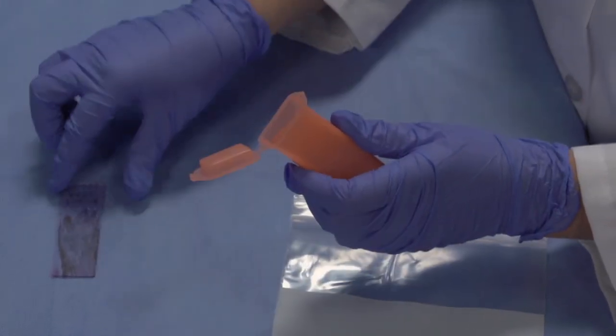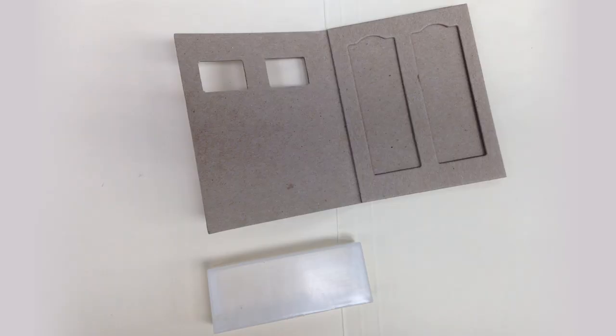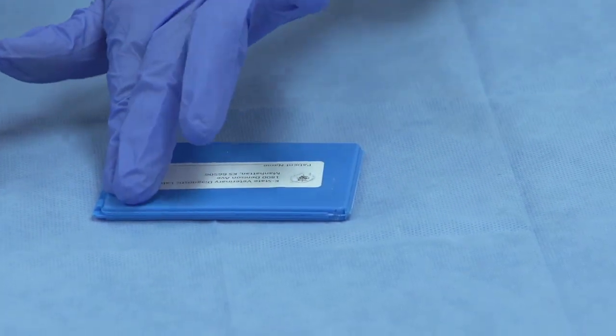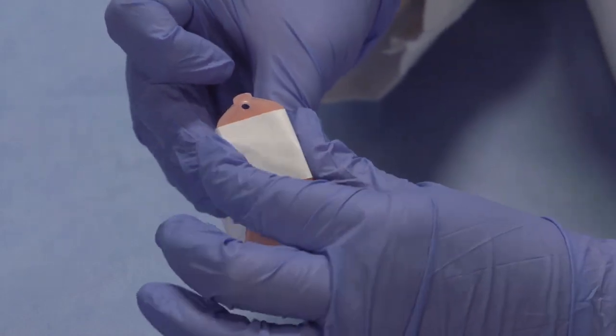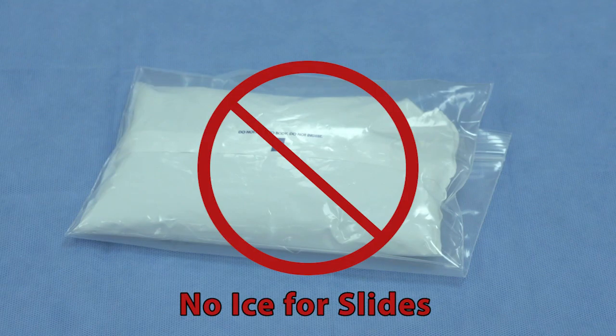These samples are fragile. They should be placed in a holder designed to prevent breakage. Cardboard, plastic, and styrofoam slide holders are all acceptable. If your slide holder has a snap top, please tape it closed to prevent it from popping open in transit. Slides should not be sent on ice packs, as the condensation may rinse the cells off the slides.